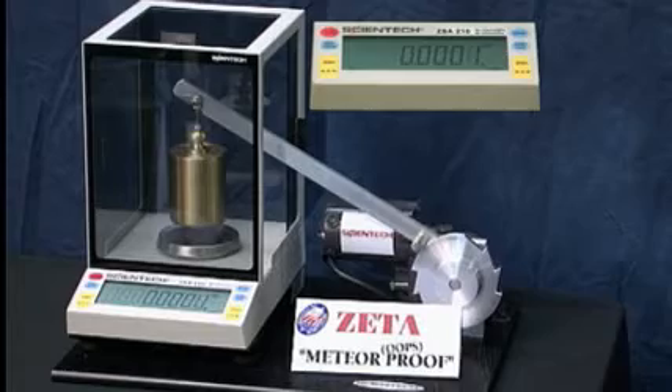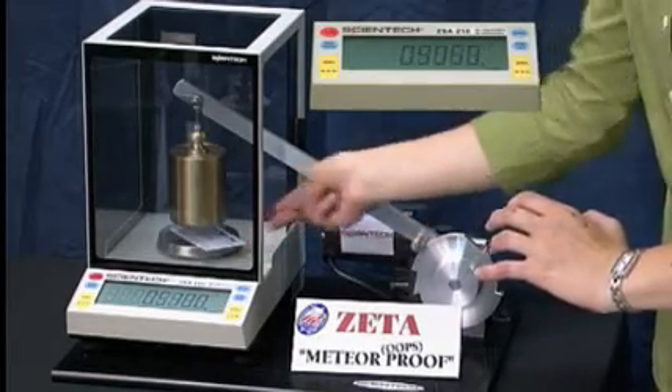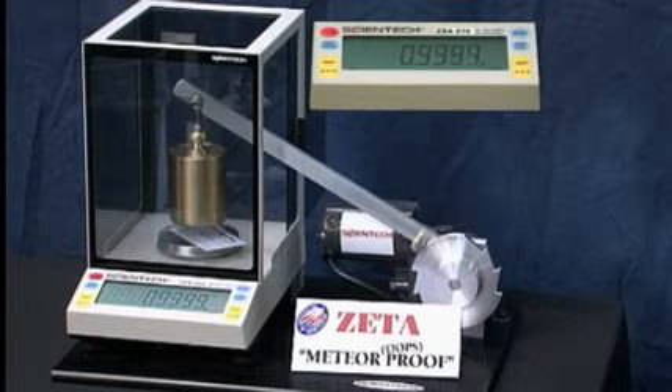We'll weigh the business card again, and see that even after such abuse, the scale reads very accurately.